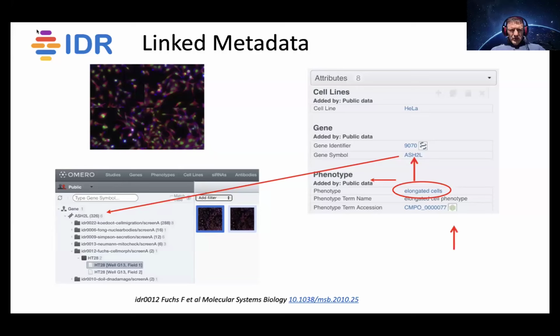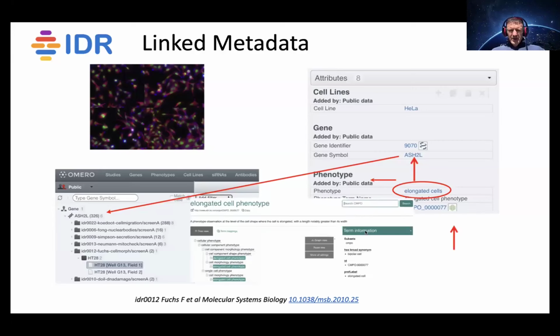And you can also see the little logo in the corner associated with the phenotype, a little symbol, which allowed us to get more information around what it means. So we are now able to link all the pieces. Someone not familiar with that term, the ontological number, can find what it means in text, but that is hosted separately from IDR.